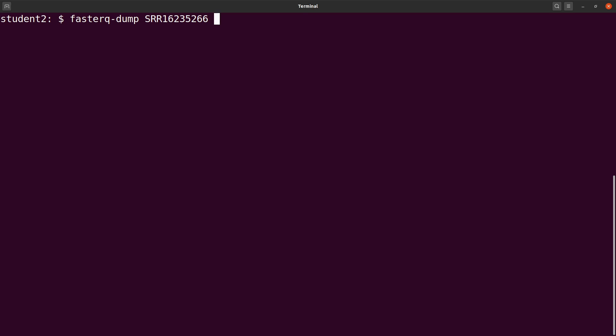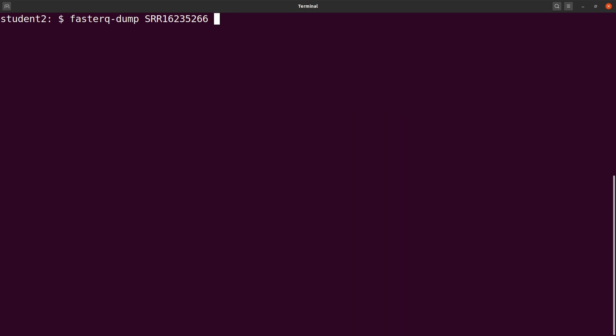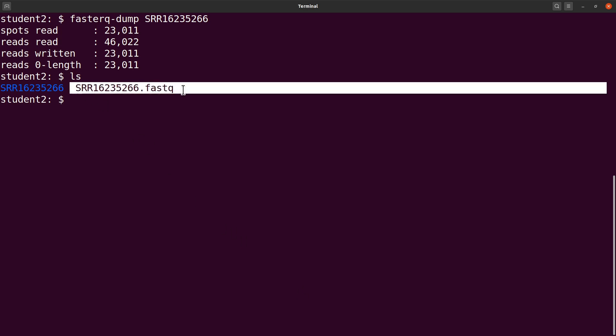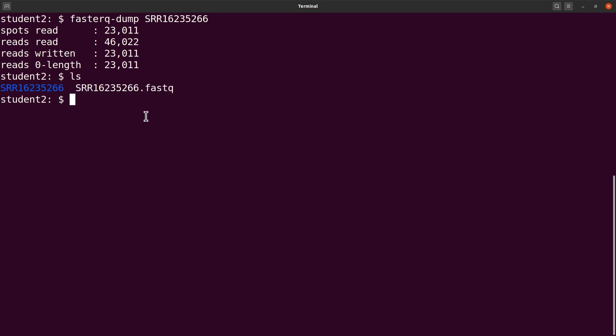By default it's using the split-3 option, so single reads will be written. We run it and then it's done. Do an ls and you see your FASTQ file here.